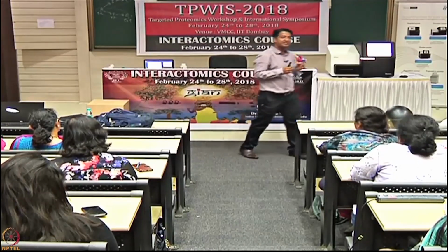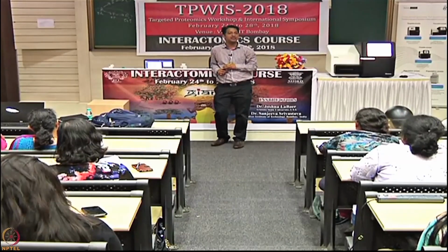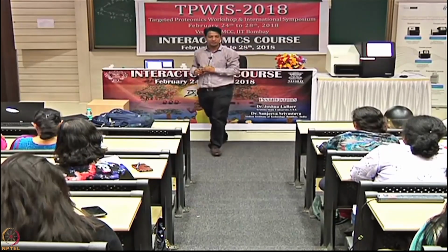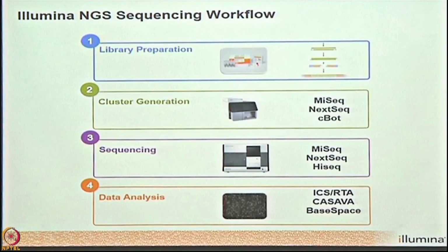So with the help of NGS technologies, you can sequence 50 human genomes in a span of 48 hours. How many? 50 human genomes in a span of 48 hours. So the key idea remains the same. The principle remains the same. Let's say you have this human genome. What we do initially is we fragment this human genome into very small fragments. And unlike Sanger, we don't need cloning at all in the case of NGS.